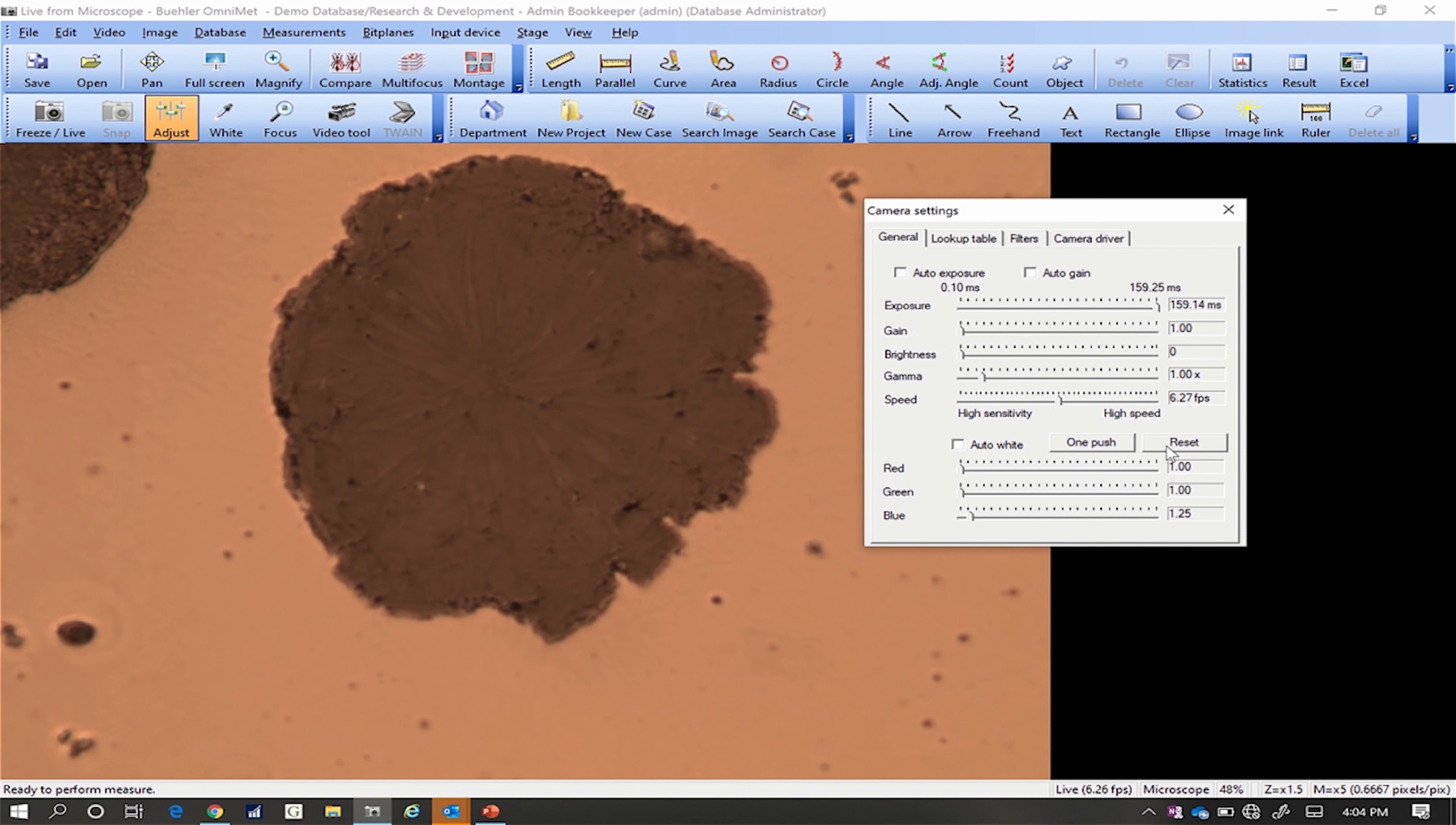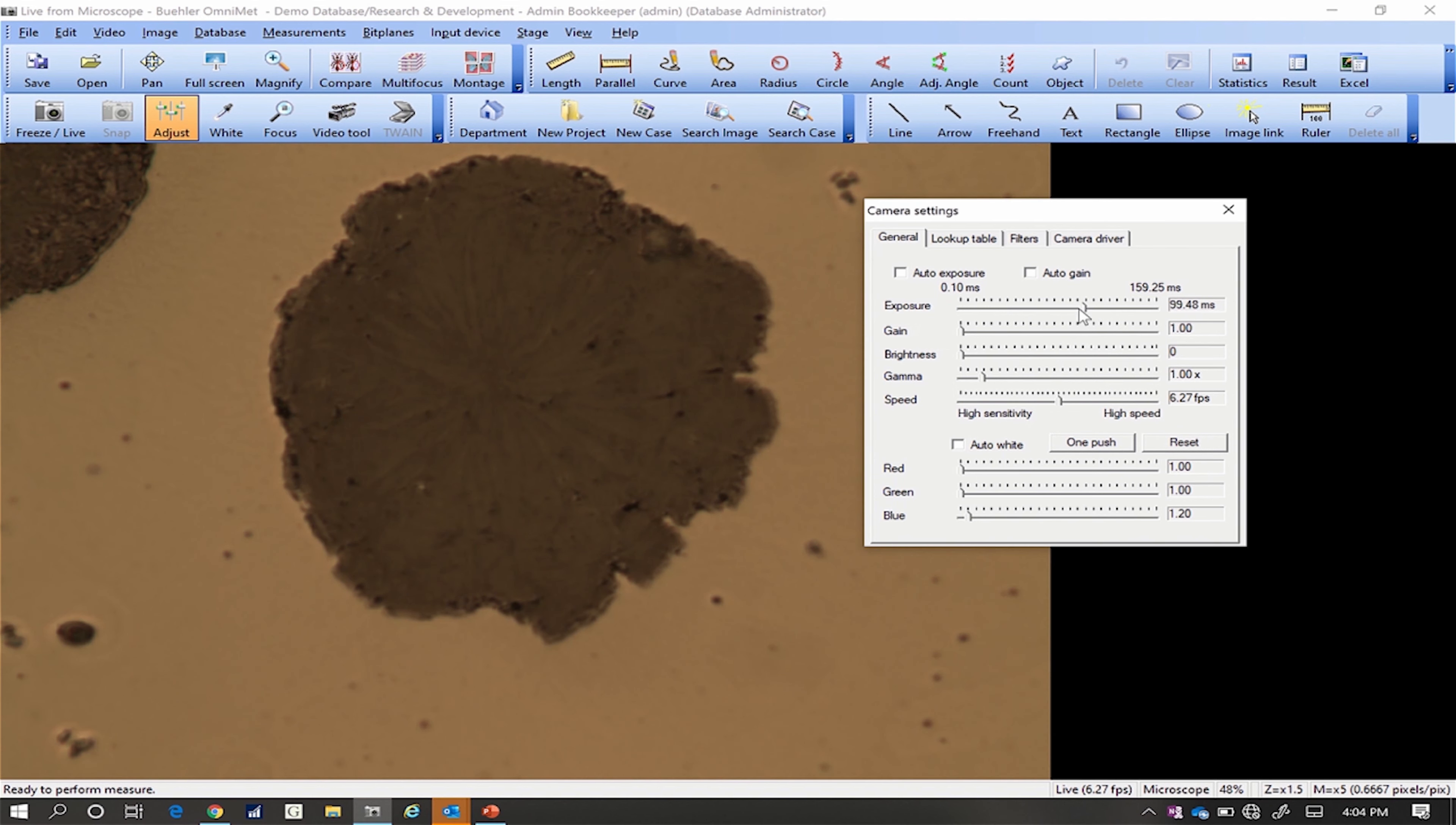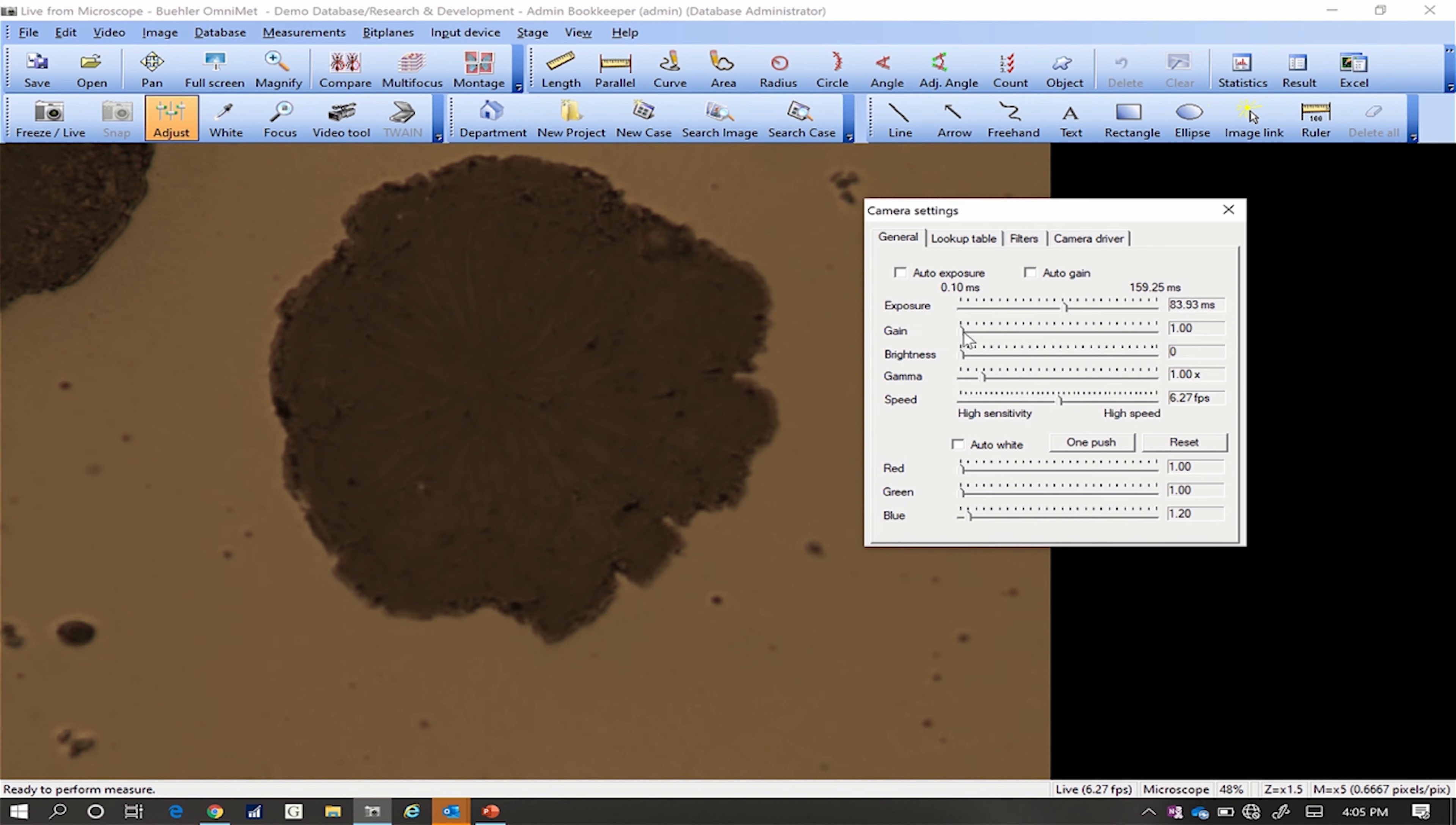We recommend the following settings for excellent performance on most microscope systems. Set exposure rate to 80 milliseconds. This provides the best compromise between camera speed and light. Set gain between 1.1 and 1.2.